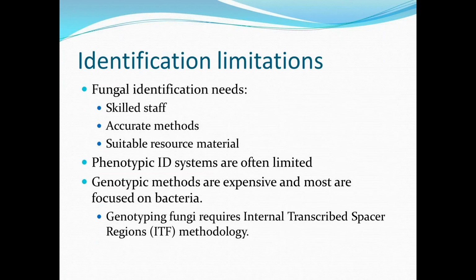Okay, so now moving on to identification. If fungi are reasonably prevalent in clean rooms, and certainly from the recall list, potential contaminants of a range of pharmaceutical products, and if the only way with non-sterile products is to know the fungus in order to characterise the risk, then identification of fungi is a matter of importance.